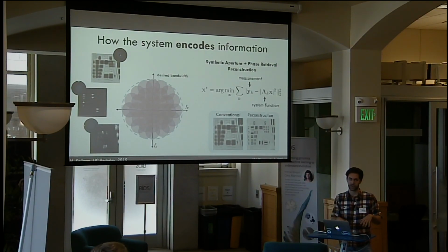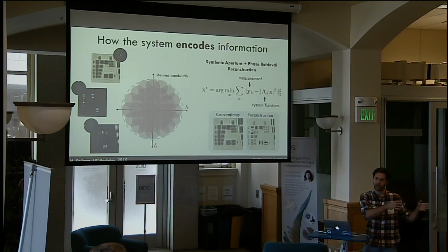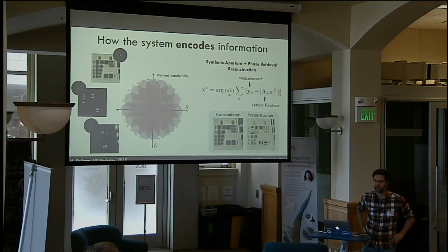So it's very conventional DSP, or digital signal processing, knowledge. A shift in Fourier space corresponds to a complex exponential plane wave times the real-space sample.